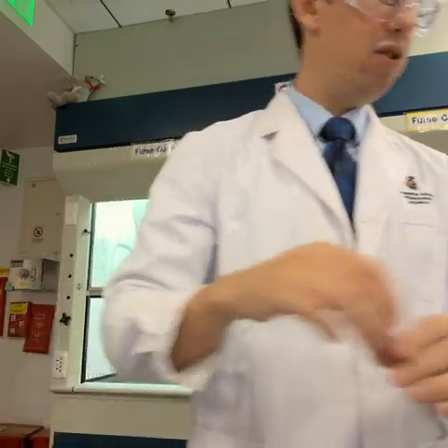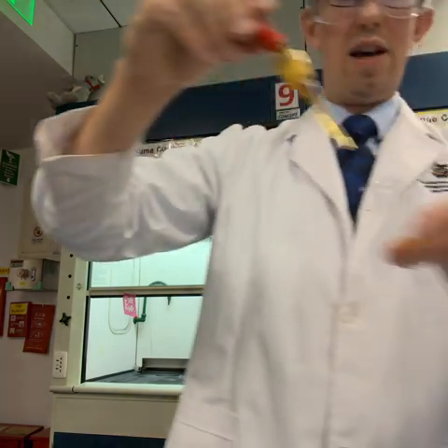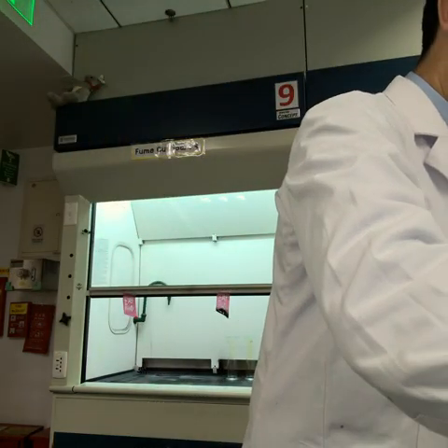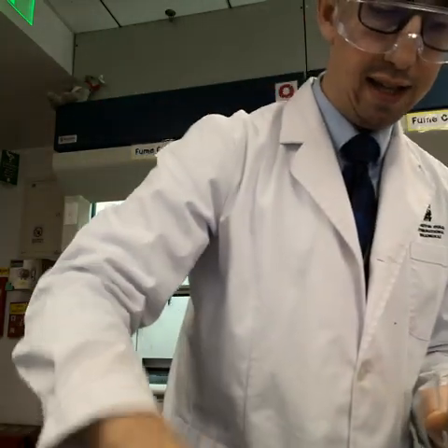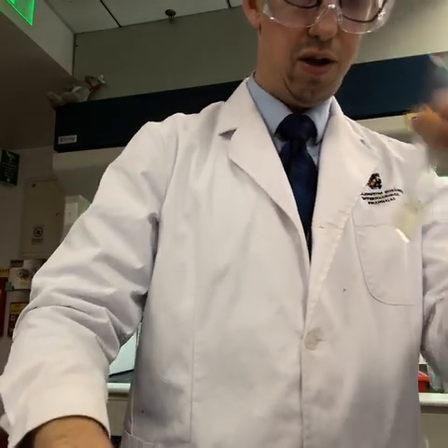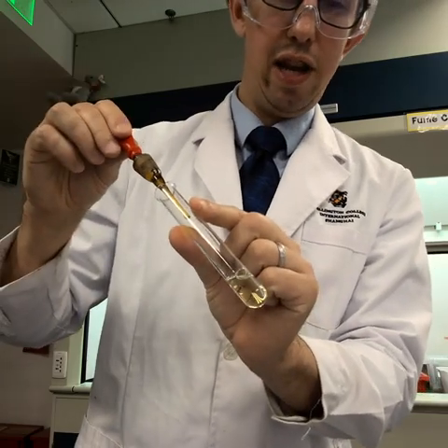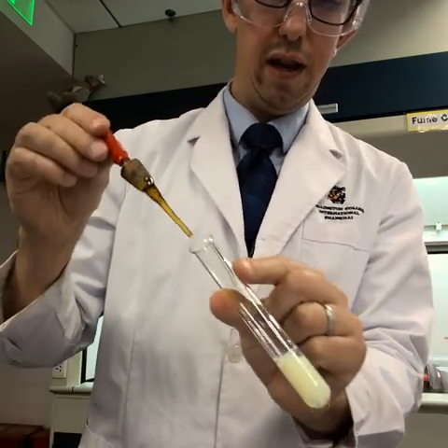Okay, and then finally we'll do it for something which has iodide ions in it. This is potassium iodide, but again, the positive ion is irrelevant. Add nitric acid, to remove any carbonate ions. Oh, that shouldn't have gone that color. And then we will add the test reagent. Must have been a bit of contamination previously there.